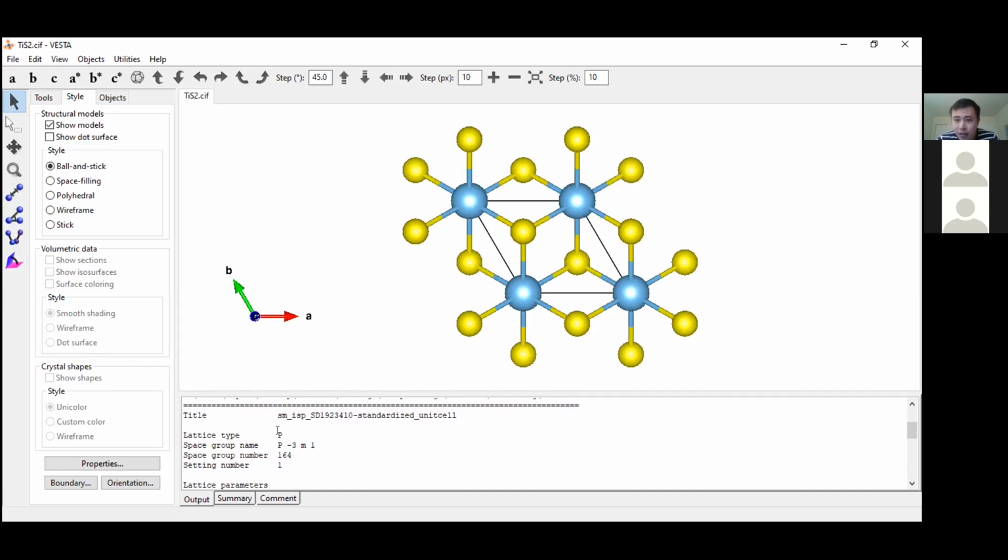C stands for additional 2 points on the base, not on every face, but only on the base, like the bottom base and the top base. So that's why sometimes you get A, sometimes you get B, but you can also get C, right? Depending on what kind of base face you define. And also we have the F, the face center, and we can have the body center. Oh no, sorry, I, which stands for the body center.